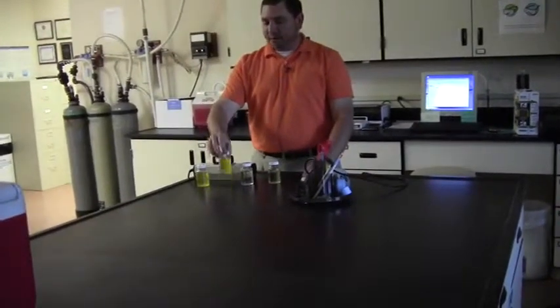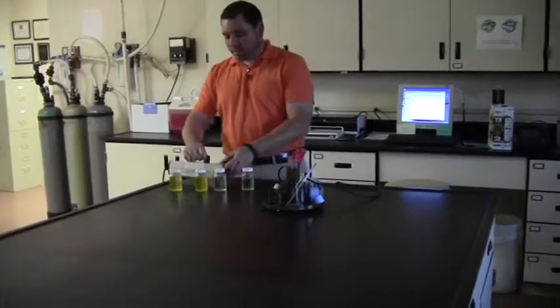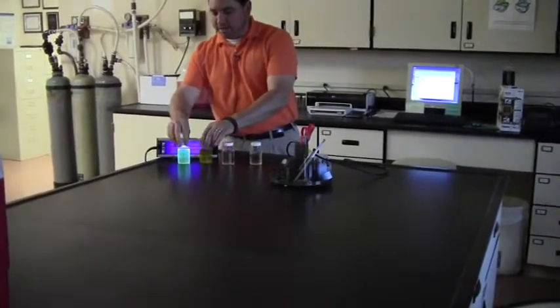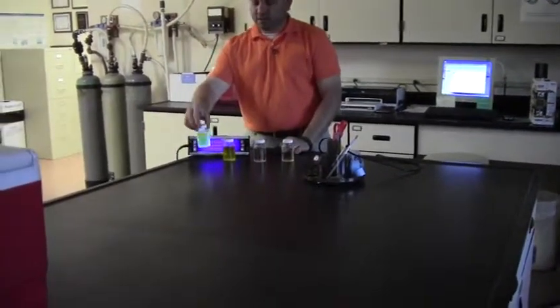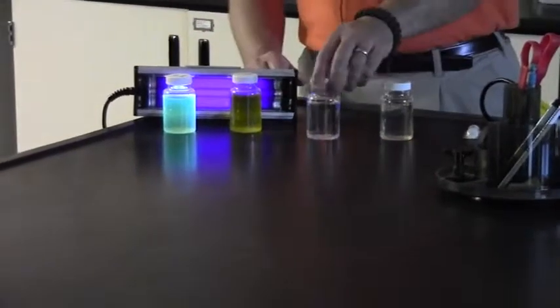So if we have tolicoliform, how do we determine if it's fecal E. coli? The reason how we do that is this. And you can see the difference how this one is fluorescing and this one is not. So we know that this is good to drink.